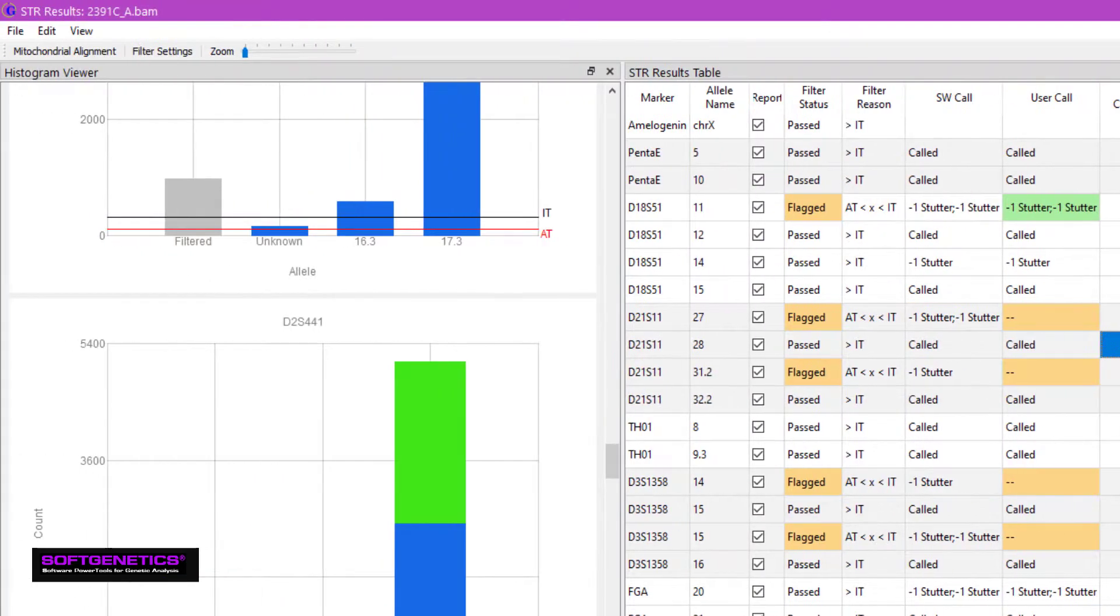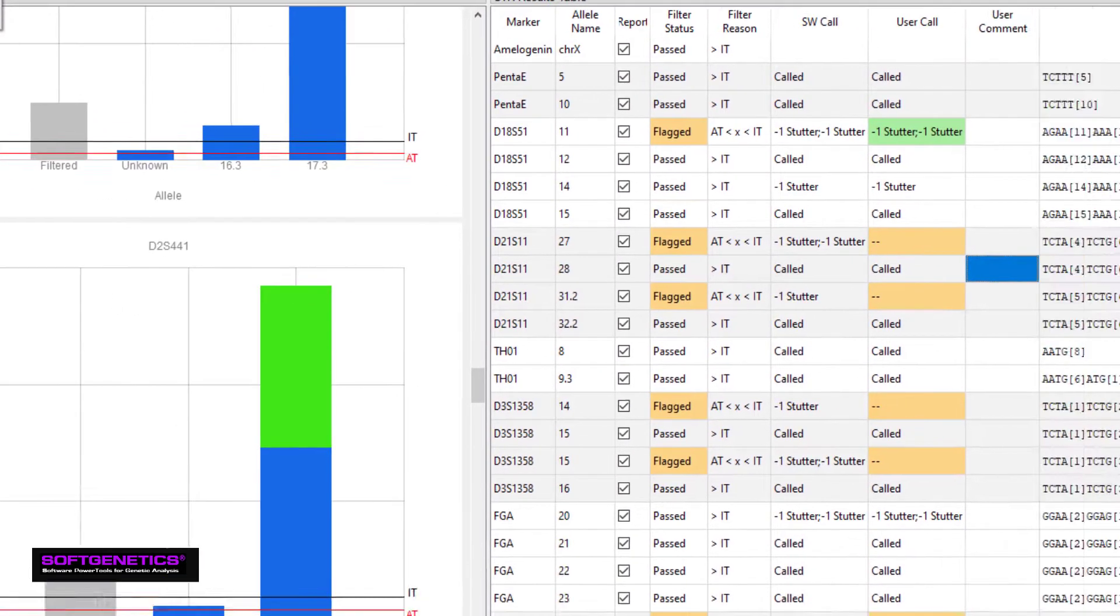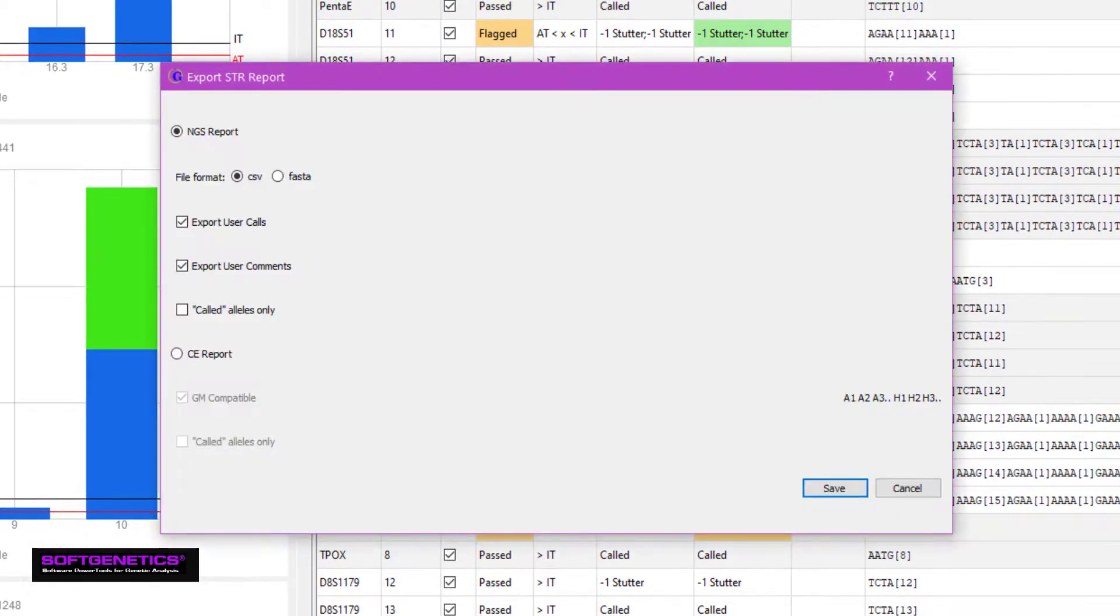The table and the histograms can be exported separately for your records. There are also NGS and CE options for the report as well.